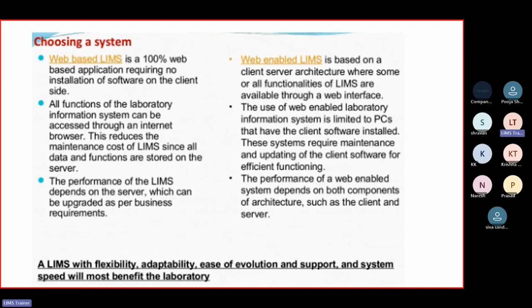So if you are at a manager level or a higher level in your organization, you can access the LIMS through your mobile as well. That feasibility is also there for Labware LIMS. The performance of LIMS depends on the server, which can be upgraded as per business requirements.